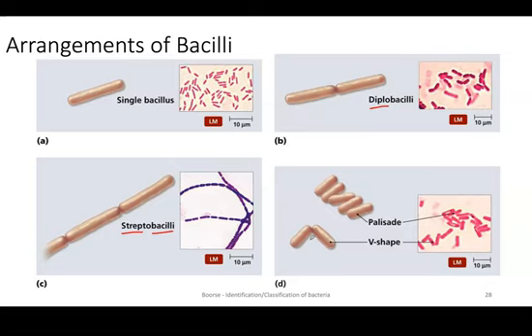At the end of the staining procedure, you get multiple pieces of information for a given bacterium. You get the size, but you can also use terms like shape or morphology. You can say this bacterium is bacillus in shape, or vibrio in shape, or coccus in shape, whatever the shape indicates.